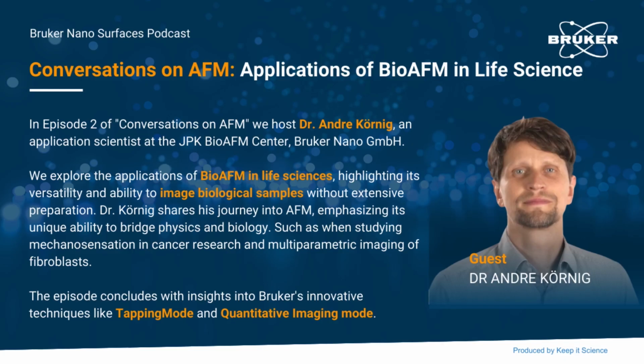So for me, even as a kind of experienced user, it's the go-to mode if I don't know what my sample is about, because, as I said, it doesn't move things around. That's why, if it's very soft or highly structured, or you might push things around, so loosely attached things, it's quite powerful. And also sticky samples, you then just increase the Z length, meaning how much you want to go up. It's quite easy to understand why you do it, and that's why, if you don't know the sample, and I mean the only drawback I could say is it's a bit slower, but it's a very stable mode.